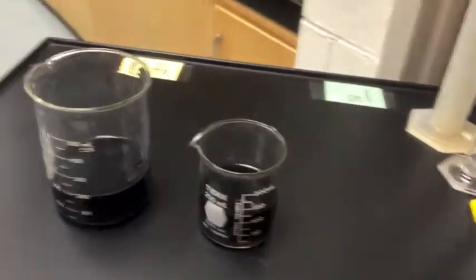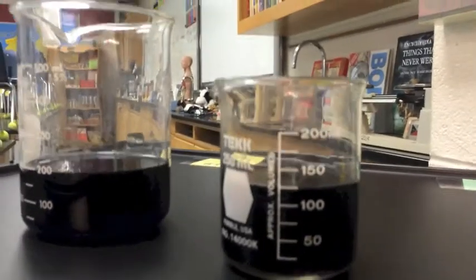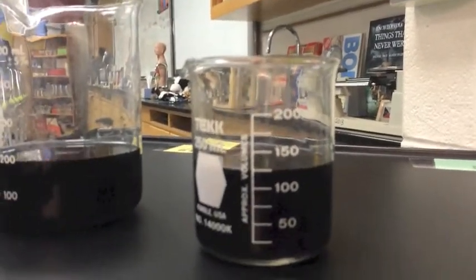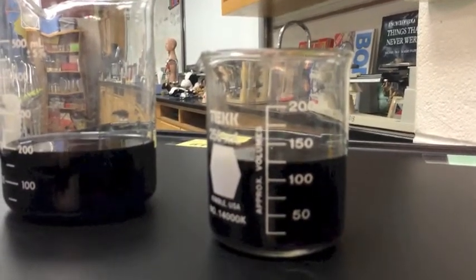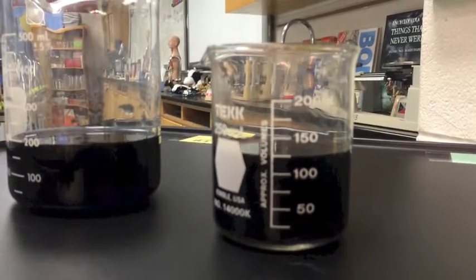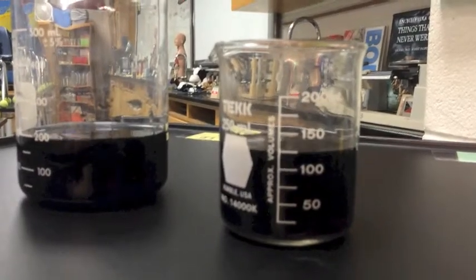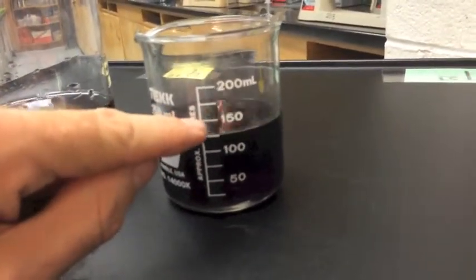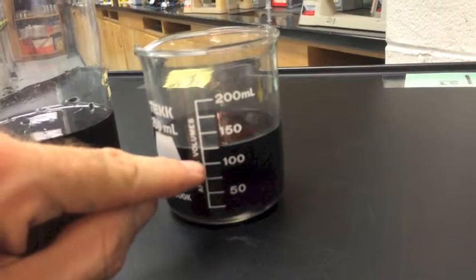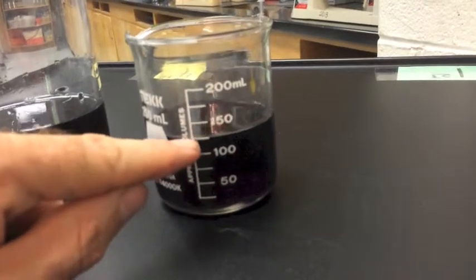This one over here is a smaller beaker, and you're going to see that the measurement goes to a graduation in between the 100 and the 150. On the 150, some of you can tell that graduation is easy enough to figure out. But in case you're not familiar with how to measure that, here is a formula you can use. You're going to see that there are a 150 milliliter mark here, there's a 100 here, and there are 1, 2 in between. So you count up from 1, 1, 2, that tells us how many graduations.